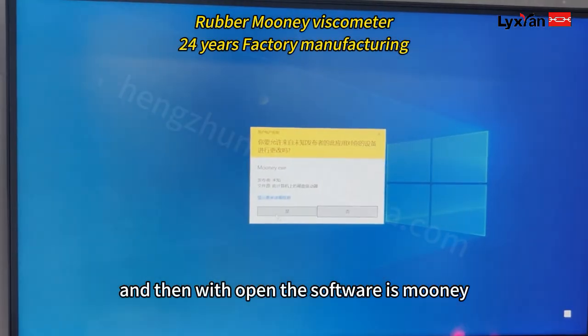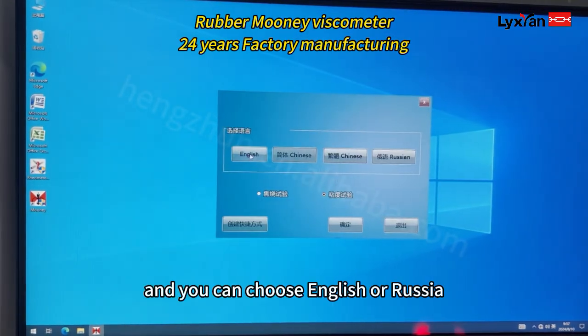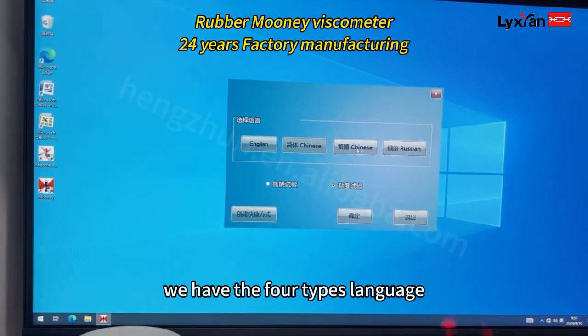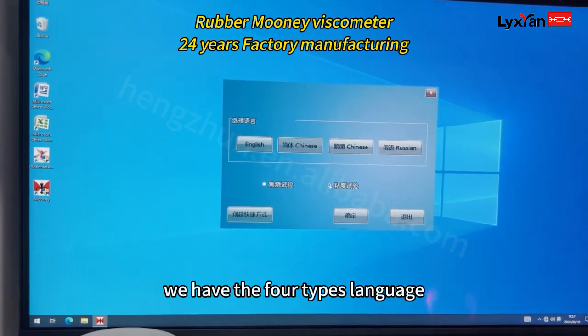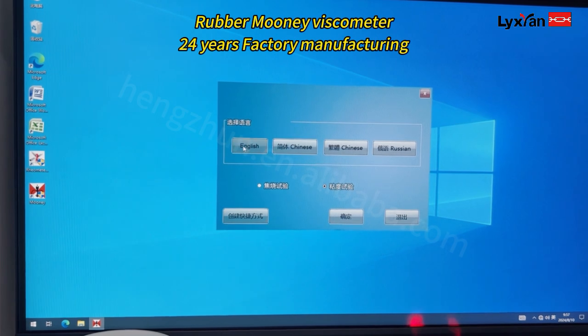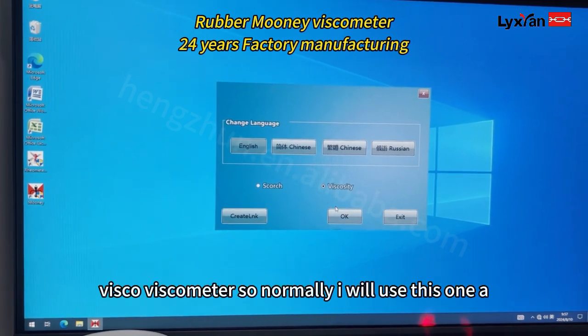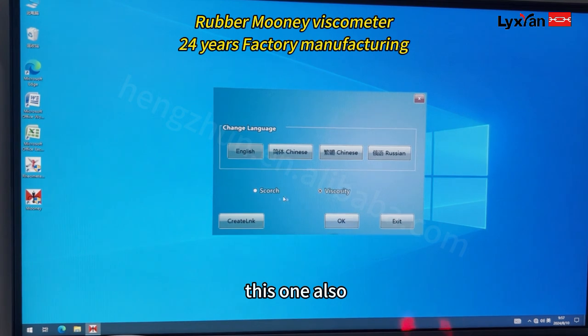Then we open the software on the computer. You can choose English or Russian — we have four types of language available. Normally we use this setting a lot.